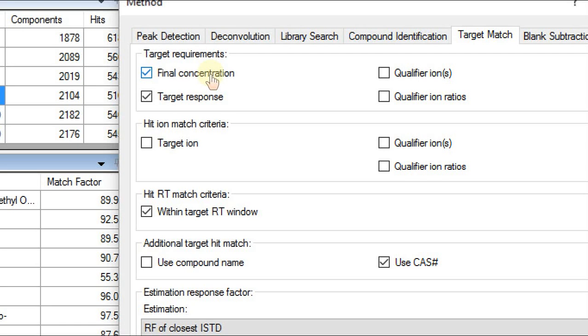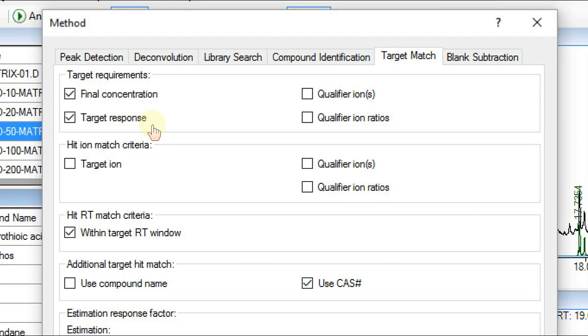So the quantitation method is involved here. The expectation is that you have used a library that has the targets, probably the same library you used as a reference library in the quantitation workflow. You're given a lot of options in the way that the matching between target method and the components that are found, library hits resulting from that, are matched.